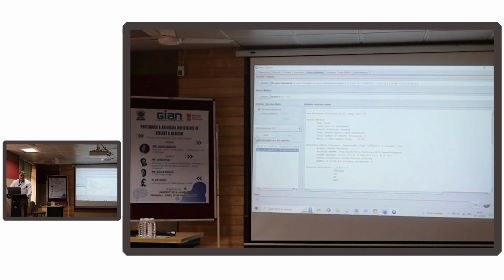So I could then go in and rerun this algorithm with just TNF alpha, IgG, ER and MMP9, and it would hopefully improve the performance. So we can use this as a parameterization tool. We've got a huge amount of flexibility in the algorithms we use, and a fair degree of flexibility in the search method we use as well. So that is one way of analysing our data. I'm going to show you some more that you can use with Weka.